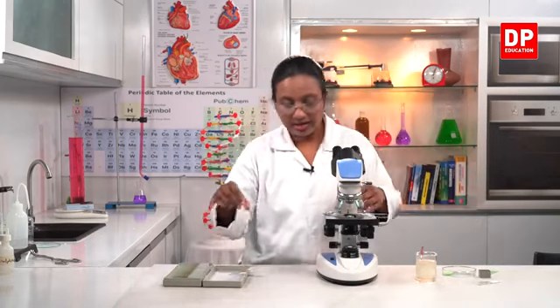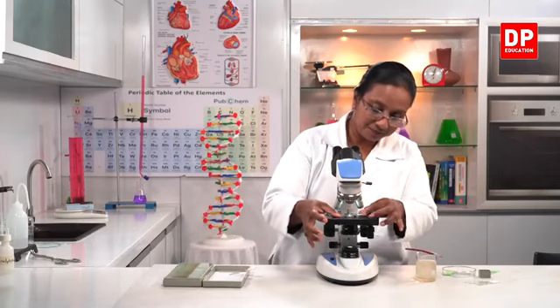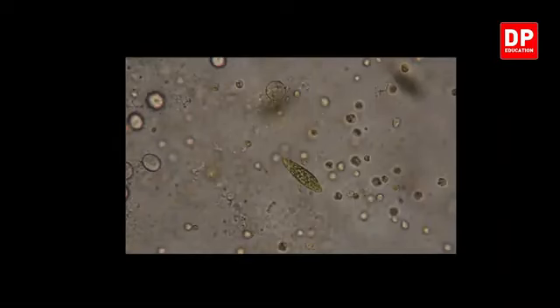Same as that, I have a euglena here, a permanent slide of a euglena. That also can be observed clearly. So here again, can you all see the cell under low power itself? You can see that unicellular structure of euglena.